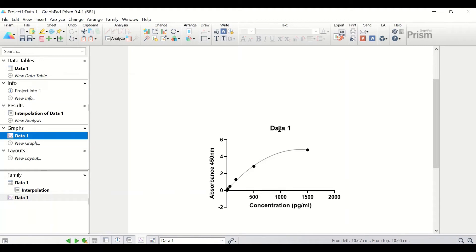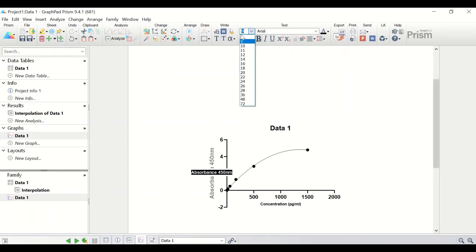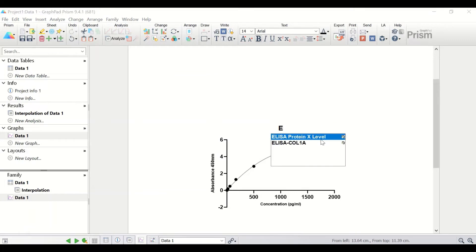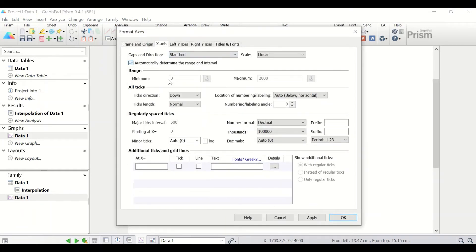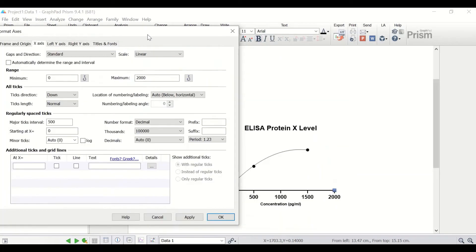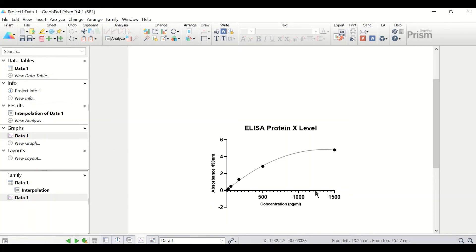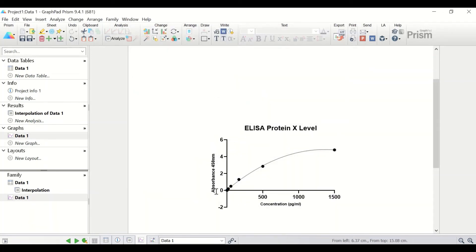Now I'll do some editing: changing the font for the x-axis and y-axis labels, and giving the graph a title such as 'ELISA Protein X Level.' I'll also adjust the x-axis range by clicking on it, unticking 'Automatically determine the range and interval,' and changing the maximum to 1,500. I'll also edit the x-axis minor tick settings.